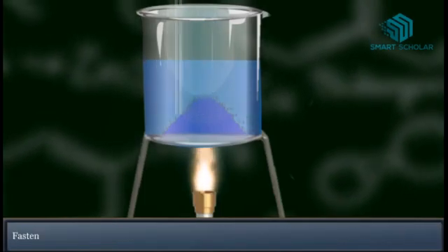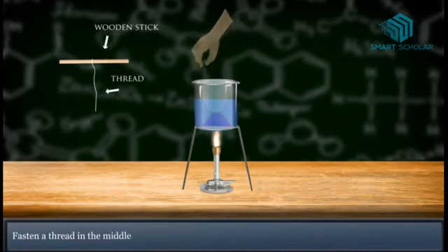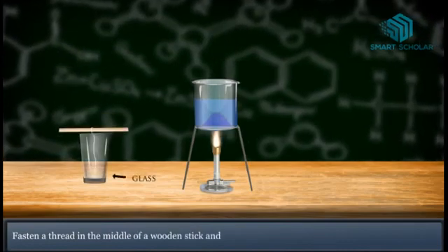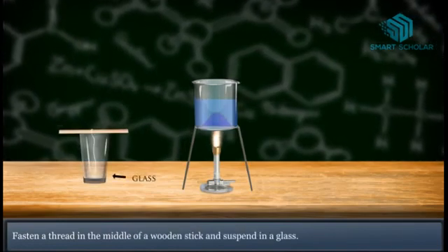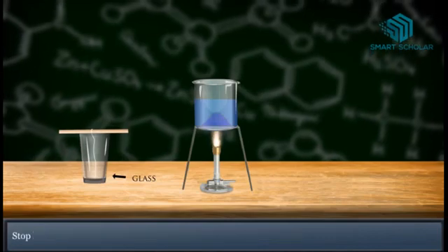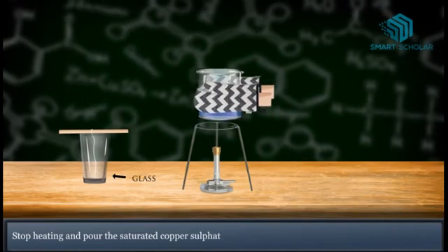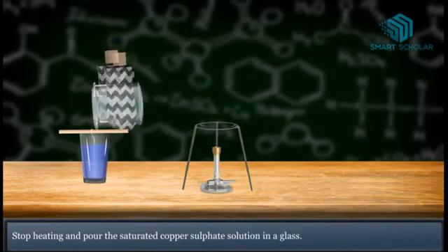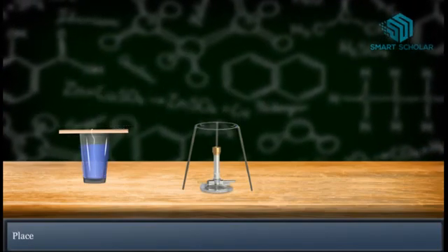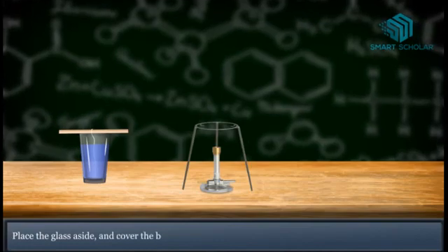Fasten a thread in the middle of a wooden stick and suspend in a glass. Stop heating and pour the saturated copper sulphate solution in a glass. Place the glass aside and cover the beaker with cardboard.